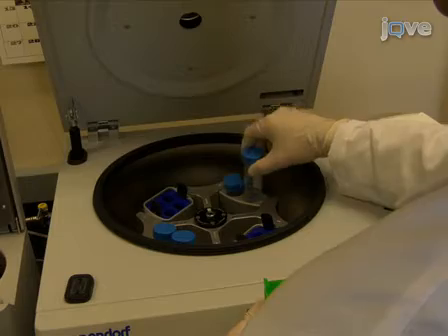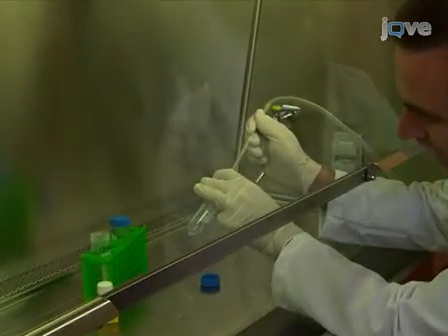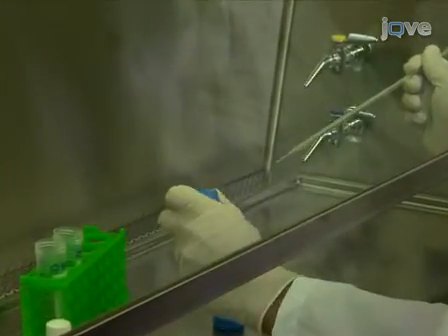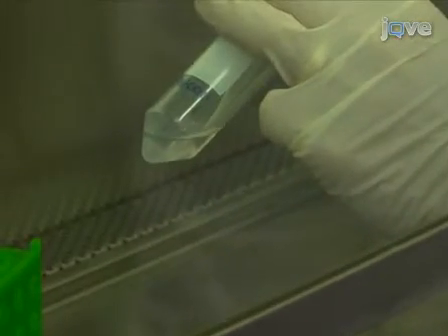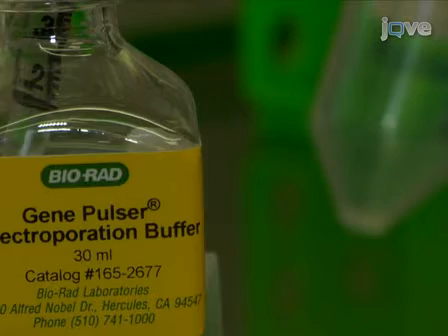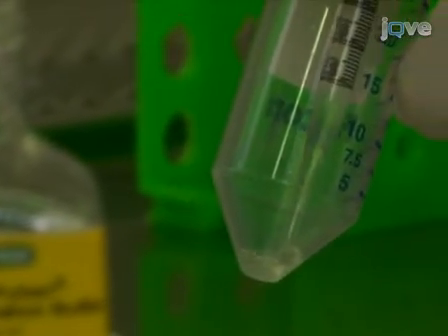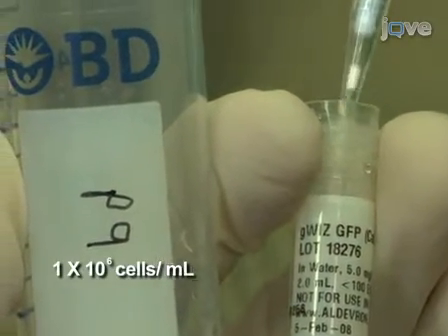Centrifuge once more to pellet the cells, then carefully remove the supernatant. Resuspend the cells in electroporation buffer to a concentration of 1 million cells per milliliter, and add 20 micrograms per milliliter of the plasmid.